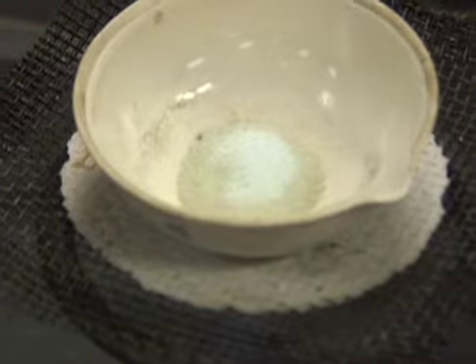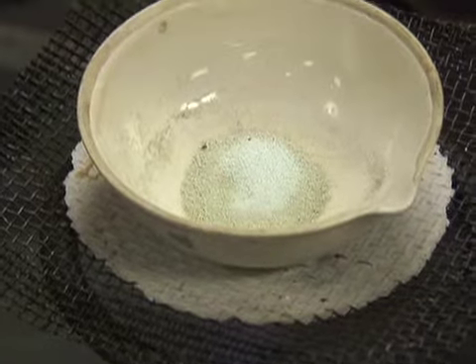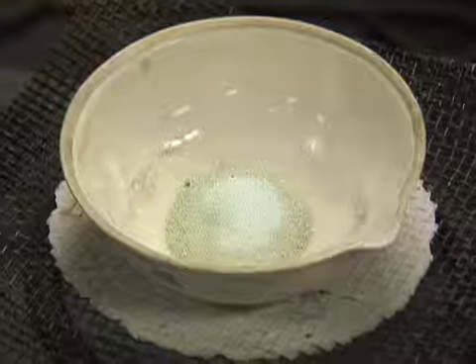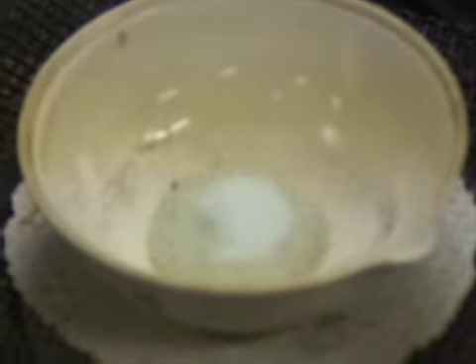The Bunsen burner is pretty hot, and therefore it goes pretty quickly. But you have to have a special setup to be able to have a chemistry lab. This would be very difficult for you to do at home. But what we're doing is standard procedure. And when you go to college, you'll know exactly what the equipment is, what the process is, and some of the tips of how to do these things.